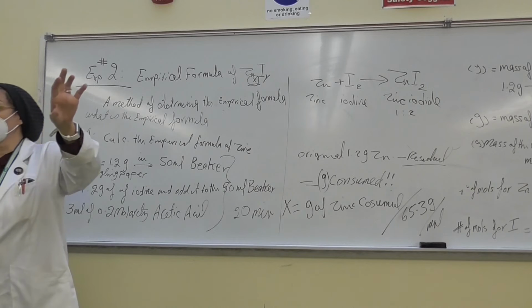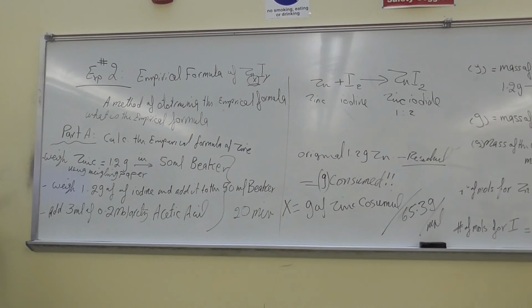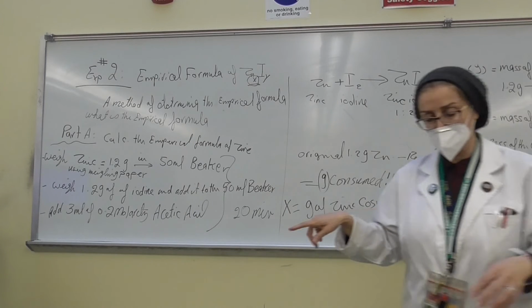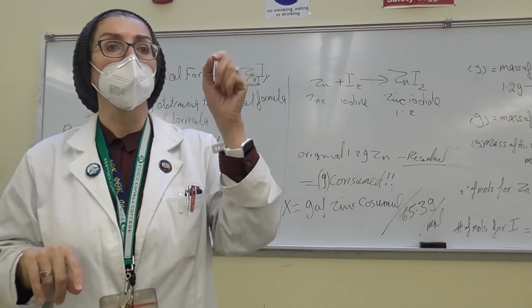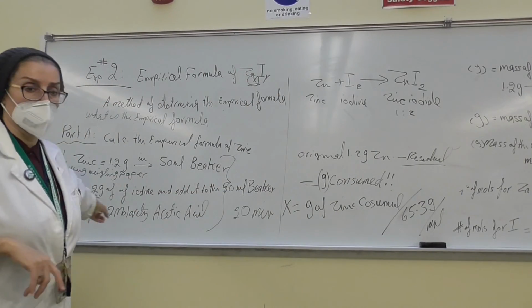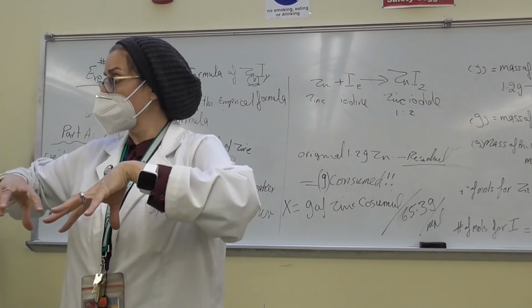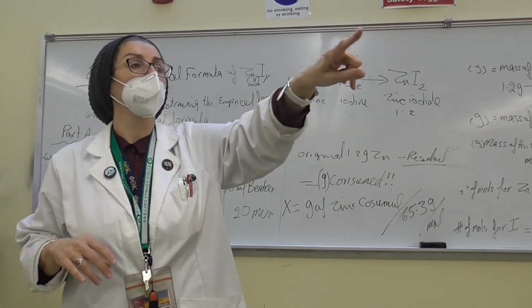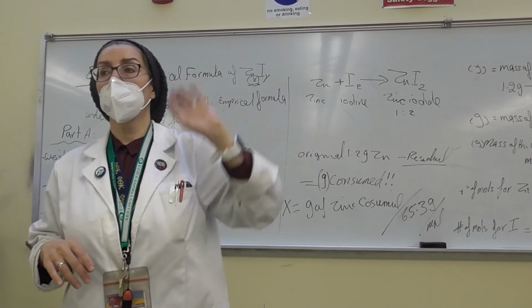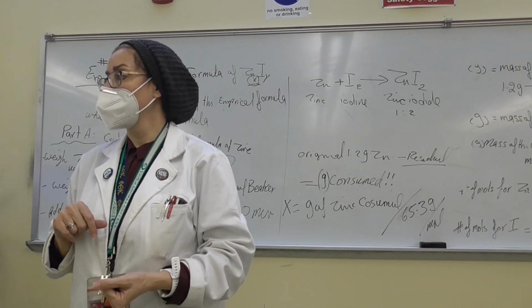You have all the chemicals. Look at the chemicals, it's already there. And you need a spatula. I'm going to give you the spatula. There is another thing that you need. Oh, the cylinder, because you want to measure the 3 milliliter. And then after that, mix them together with the 3 milliliter after you weigh them. All right, make sure that you tare the balances before you weigh, okay?